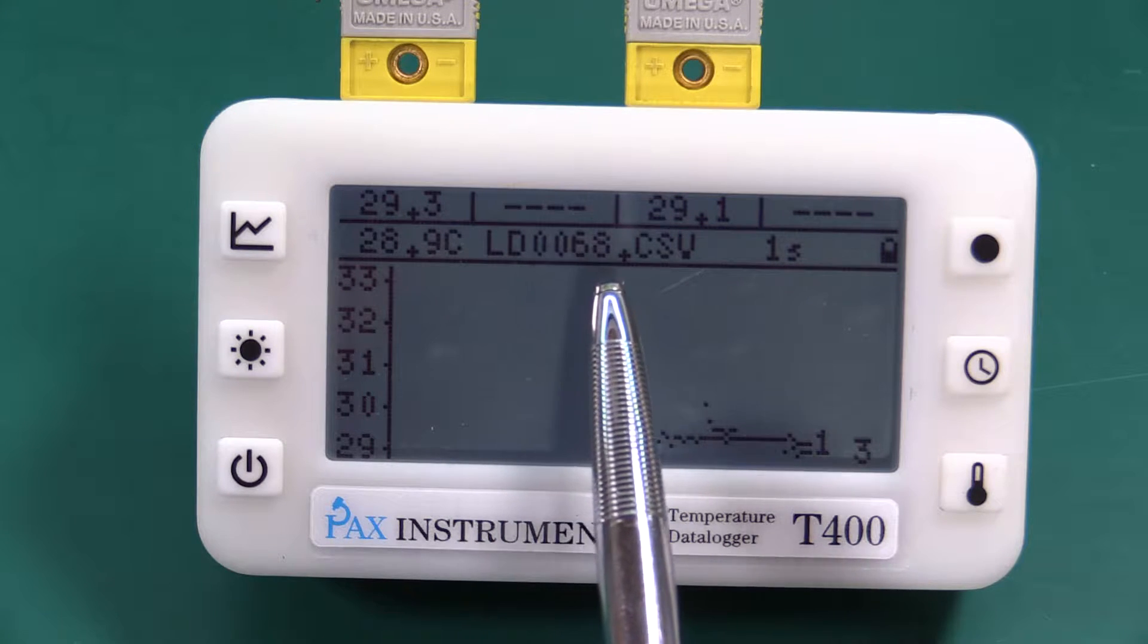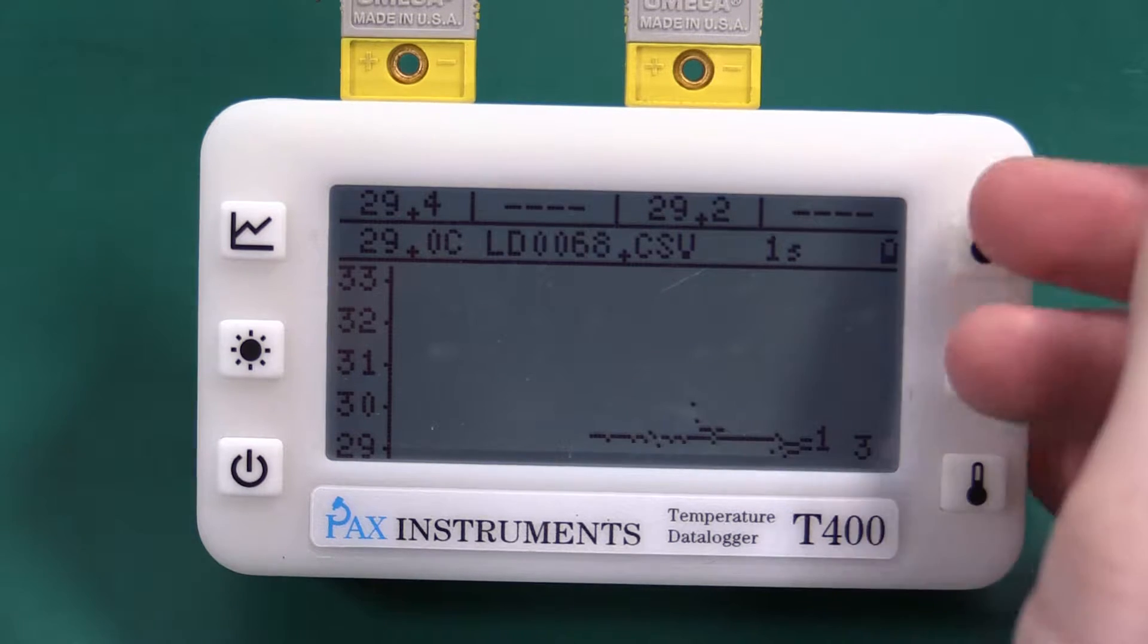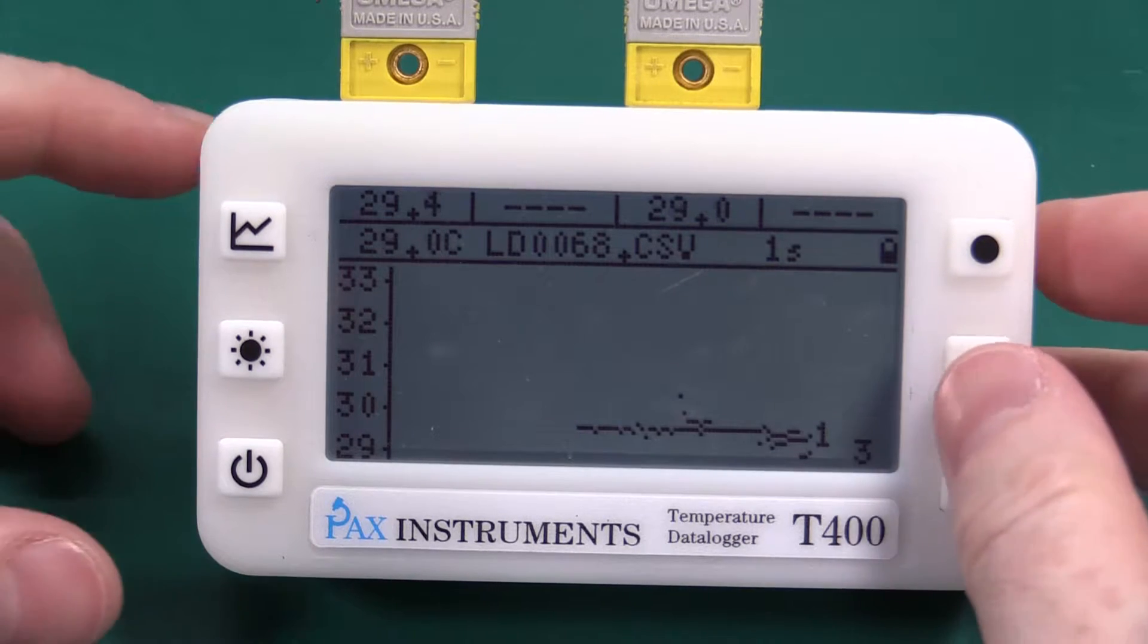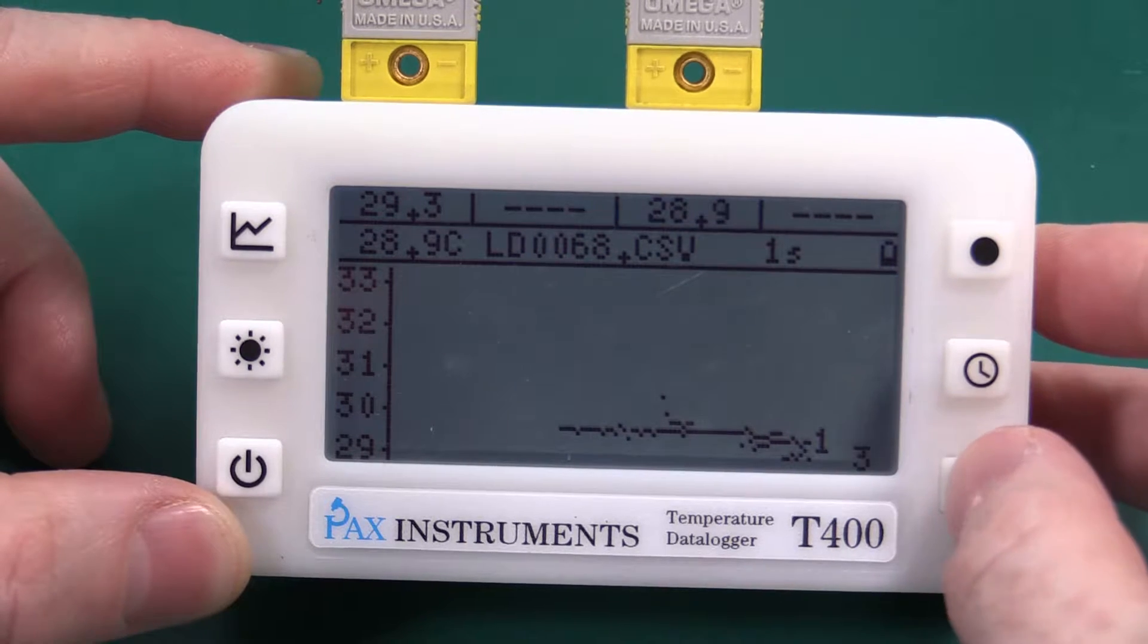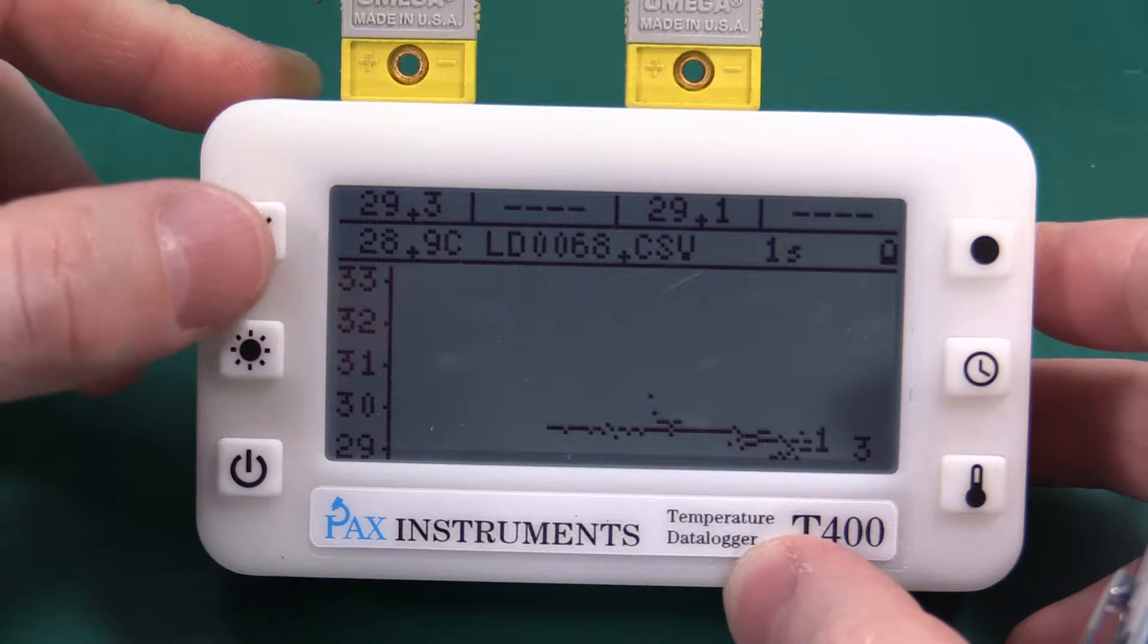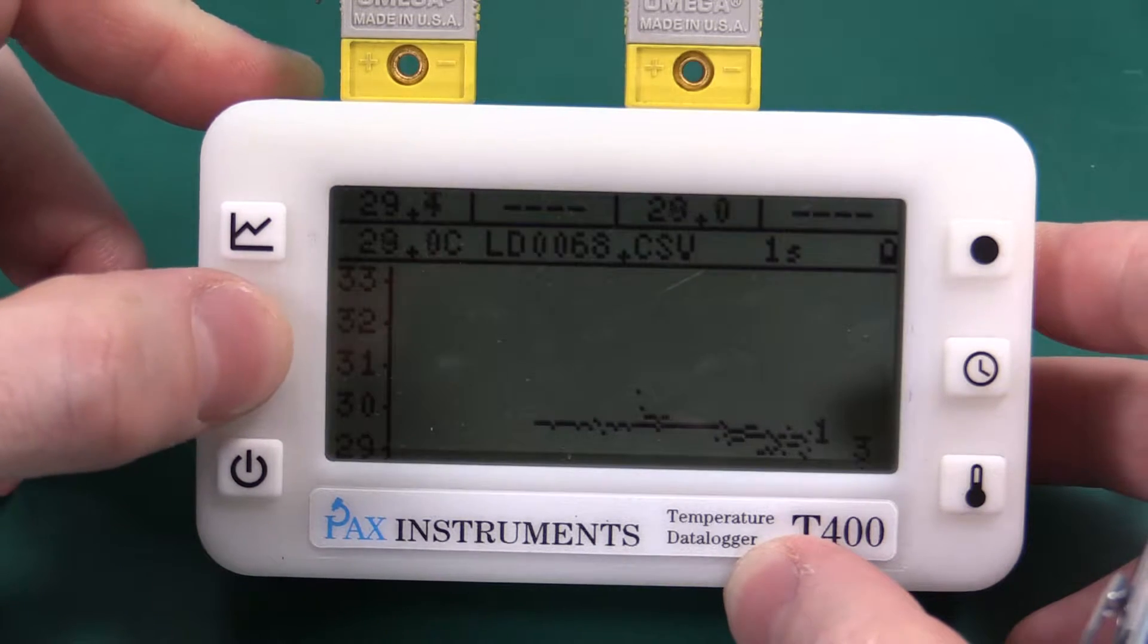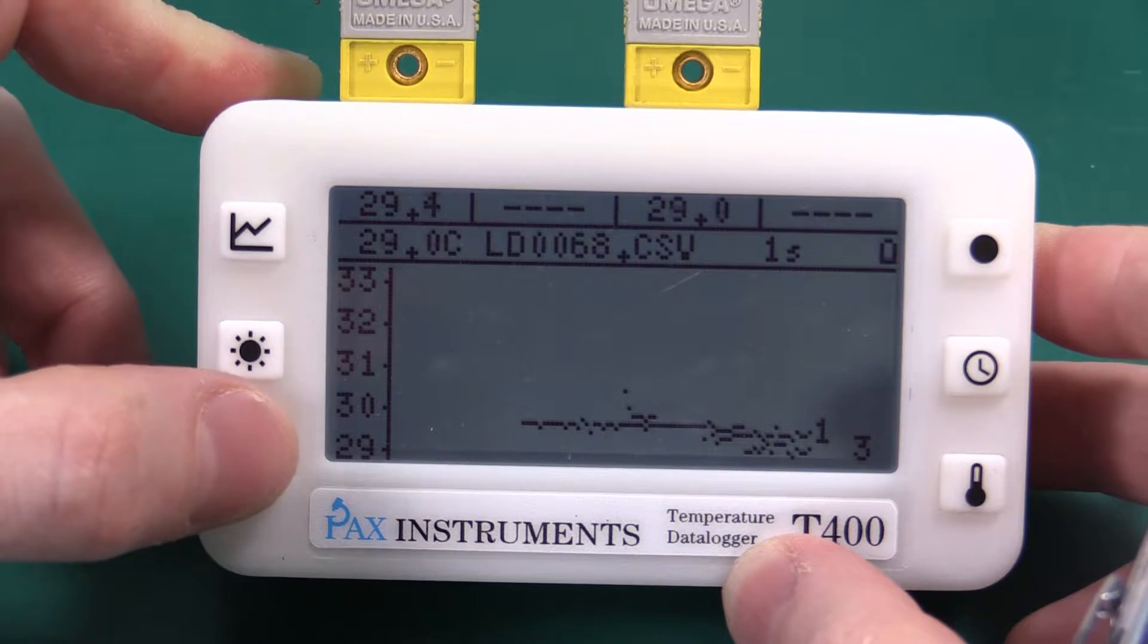LD0068, standard CSV file. What's nice in this mode you're unable to change the time base, you're unable to change the units. You can still change the backlight but you cannot power the device off.